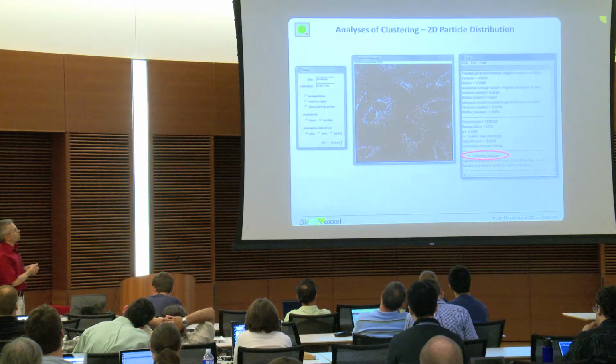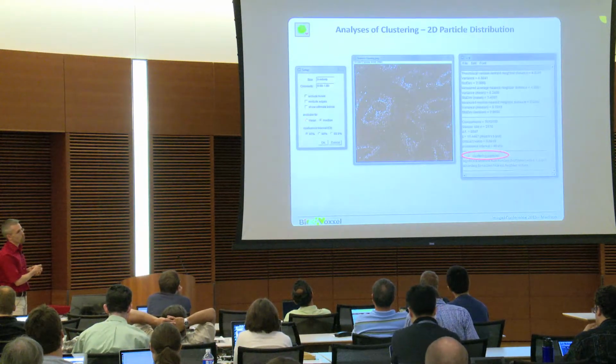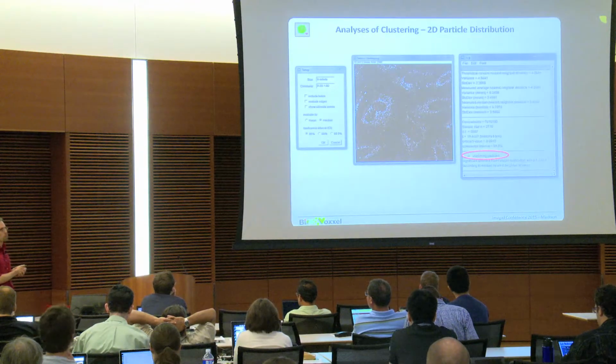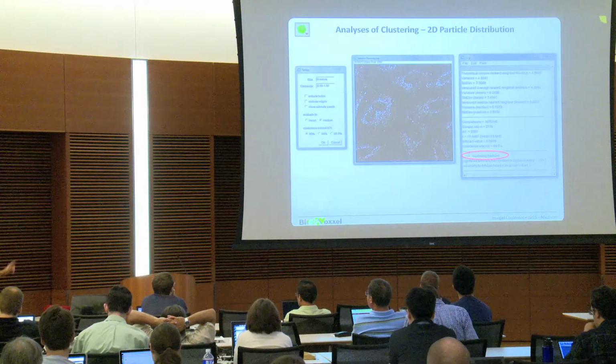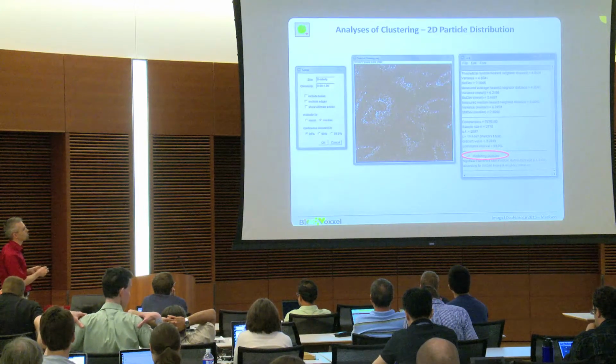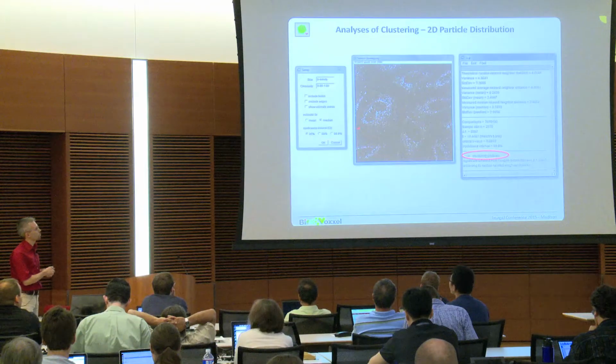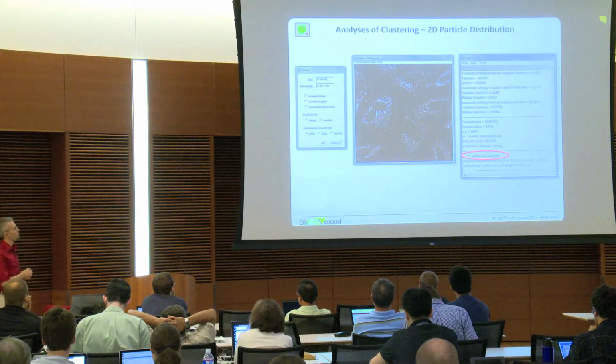So you see here we have the same options, exclude first of all things, and then we can do the comparison by either the mean distance or the median distance. So if you use the mean distance, you need to be careful, because otherwise if you have a lot of outliers, they're included and mess up the results. So if you have a lot of outliers, the median would be better. Otherwise, mean is fine, and you can choose a certain confidence interval with which you want to analyze that.